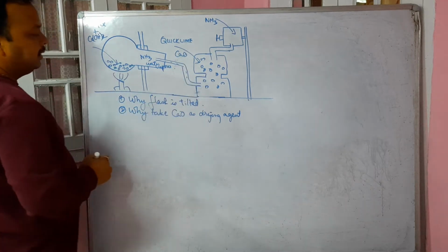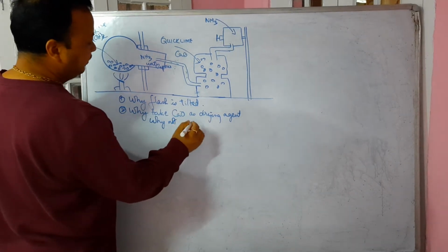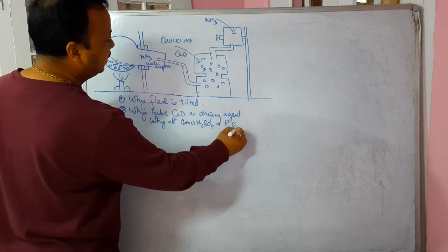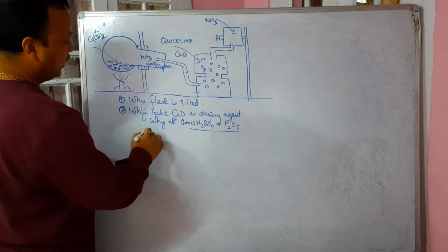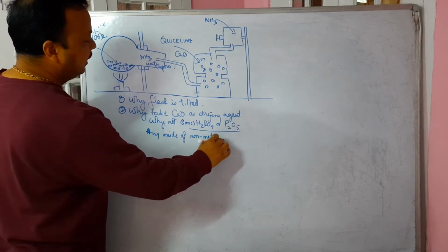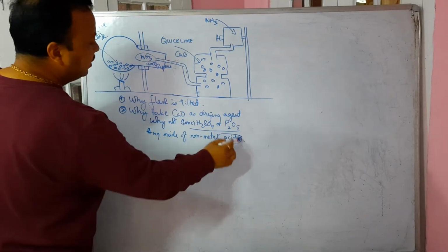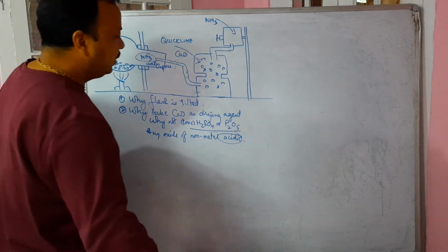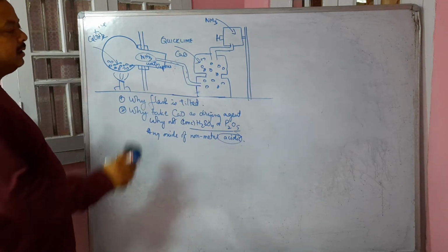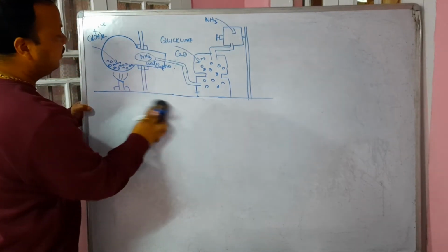Now, regarding the use of calcium oxide, the question is, why take calcium oxide? Why not, say, concentrated sulfuric acid? Or why not phosphorus pentoxide? Remember that any oxide of a non-metal is usually acidic. So you have a base here and these are acids. They will react. To avoid the reaction, we use another base. Calcium is a metal, so the oxide of a metal is a base. That is why they will not react. This is the answer for these two.